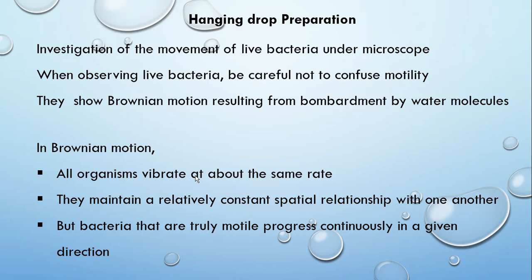But you can identify Brownian motion clearly because all organisms vibrate at about the same rate. In Brownian motion, they maintain a relatively constant spatial relationship with one another. But bacteria that are truly motile progress continuously in a given direction.